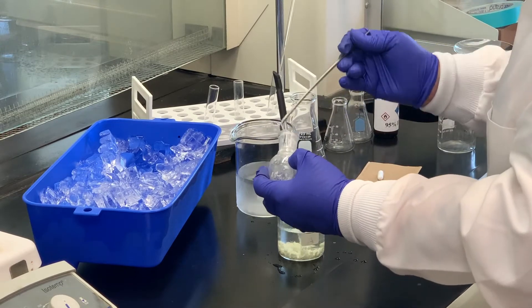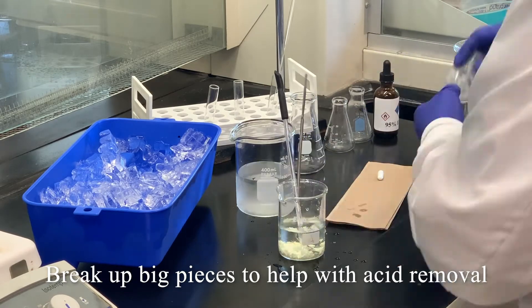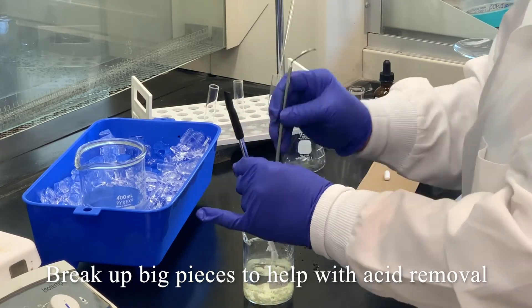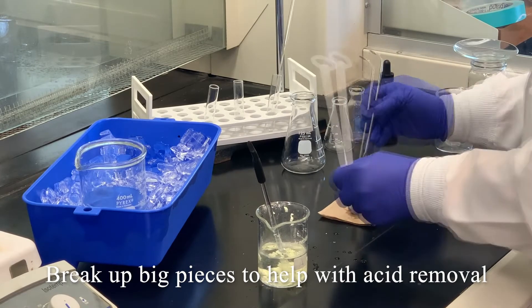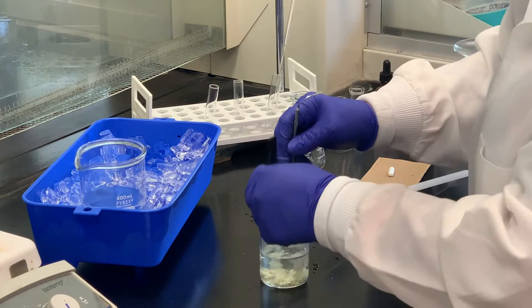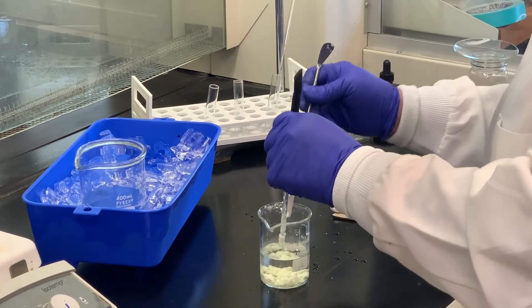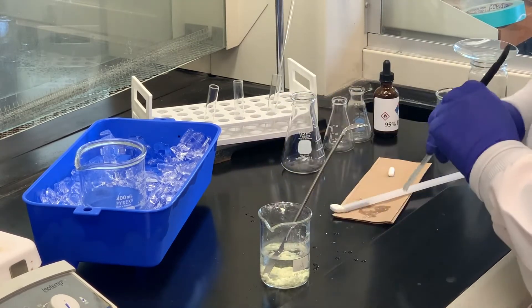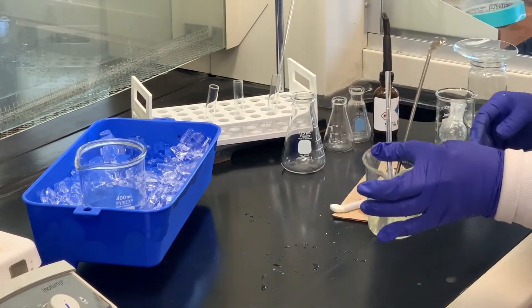I think that's about as good as we can get — it's going to be impossible to get every last trace. Now what we'll do is take this to the Büchner funnel, wash it with some more water, and then go through the fractional crystallization.